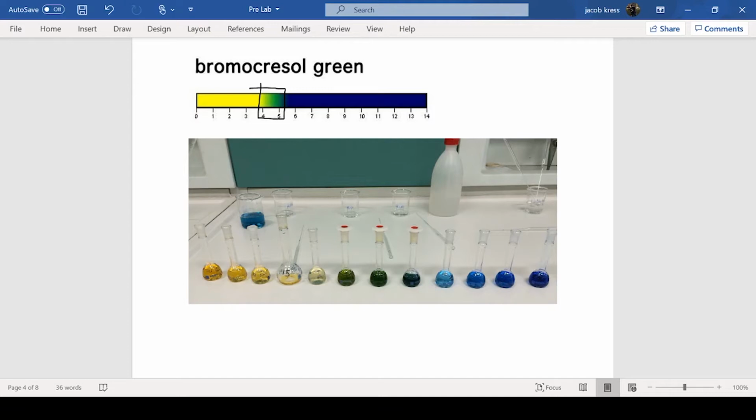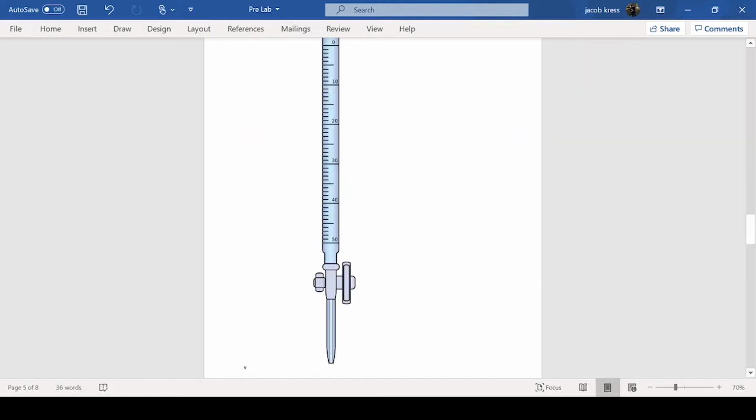In practice, the difference between the acidic solution and the endpoint is very subtle, especially if you don't have enough indicator in the solution. And this indicator specifically is very easy to over titrate into the blue. And once you're into this color, you know that you've overshot your titration. Sometimes you don't even see it, you'll just go right by this without realizing it. So these guys right here are the proper endpoint.